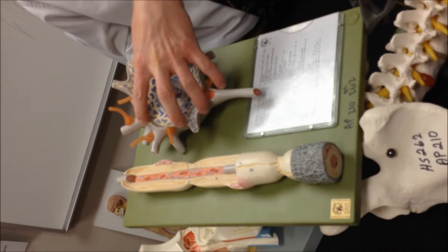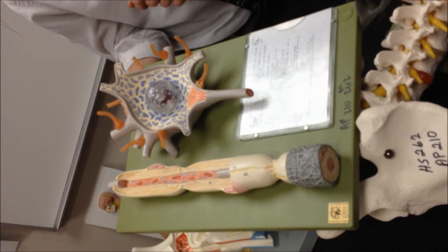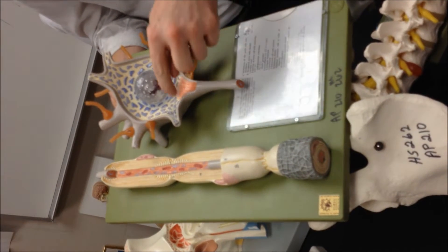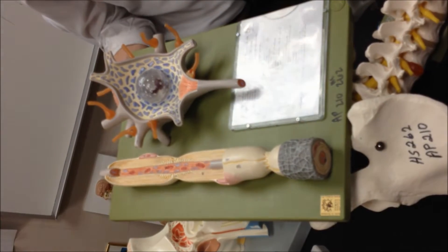All right, so the neuron cell body, you've got the nucleus, all the little blue spots in here are the Nissl bodies, the little black lines here are the neurofibrils.